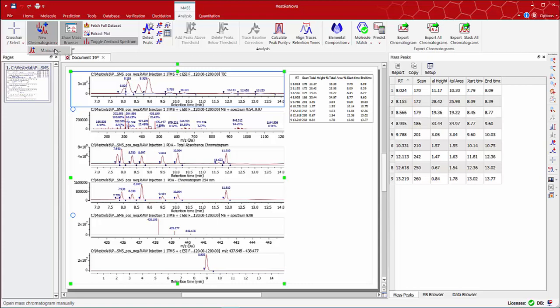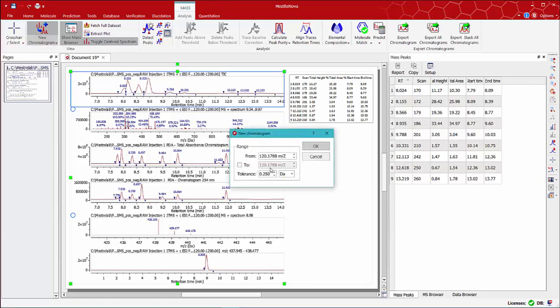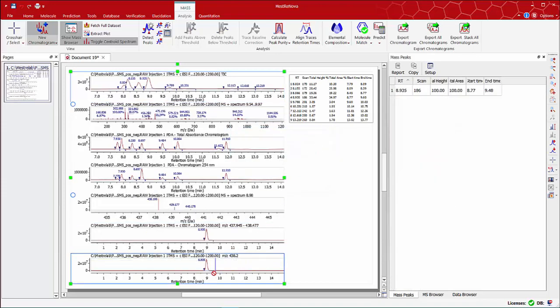Or you can use the manual option, entering the desired mass range, for instance 438.2, leaving the same tolerance value. This generates the new mass chromatogram with the specified range.